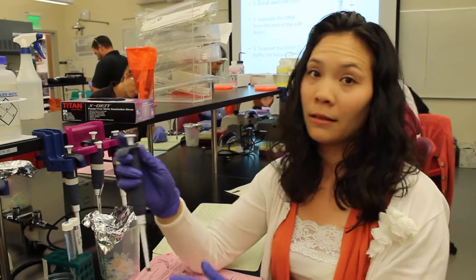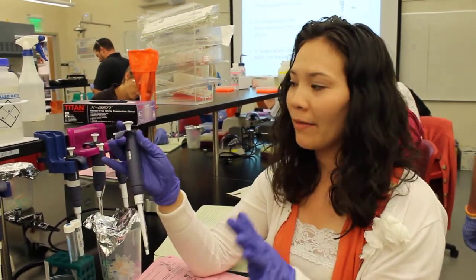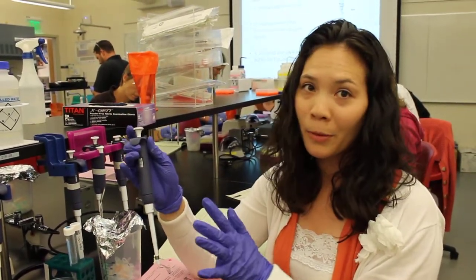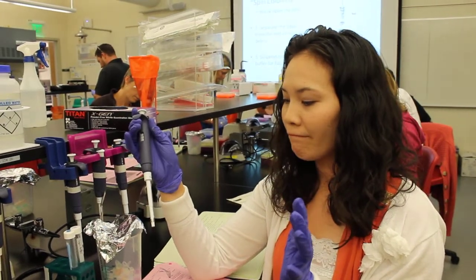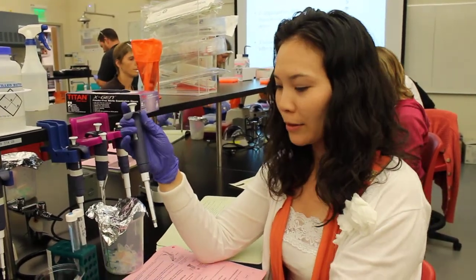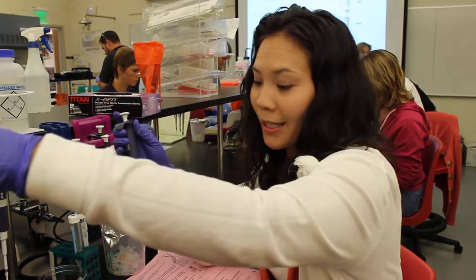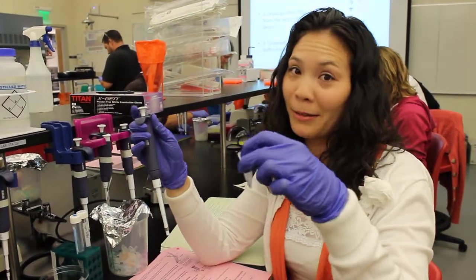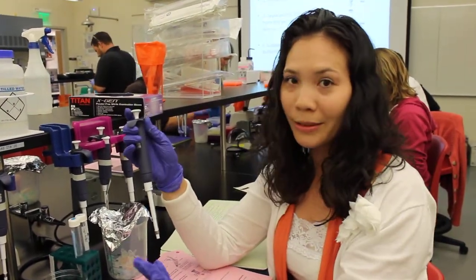This is all new to me. In fact, I've never even worked with a micropipette before. Are you ready? Yes. I've always thought these things were simply cute, but that's about as far as I've ever got with them. Now I can see their purpose.